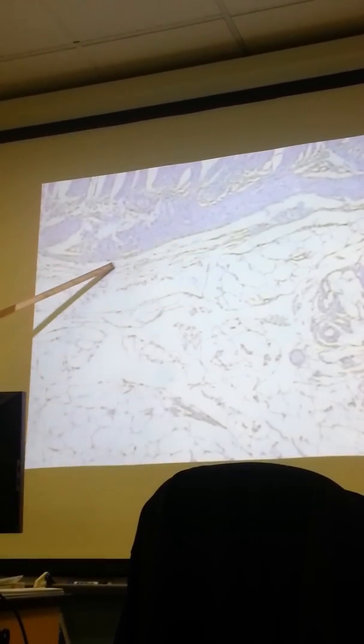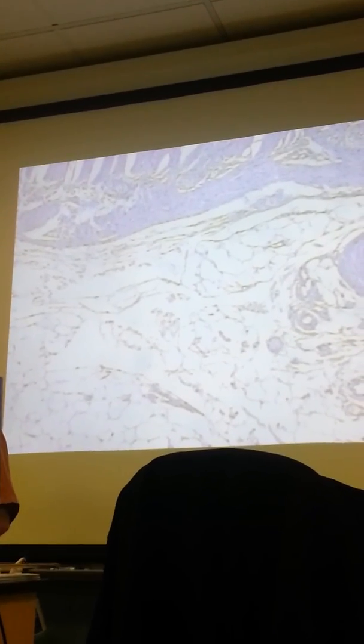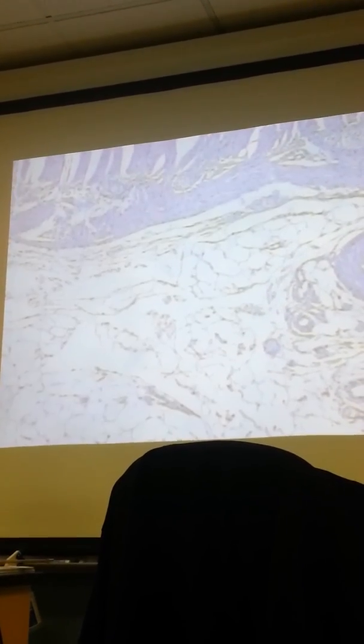In this case, we're getting a bunch of other tissue, fat. See how it's all adipose? But we have that probably right there, which is our serosa. Nobody said they're just going to put the right tissues on the slides. So that's jejunum. We're moving on. You ready?